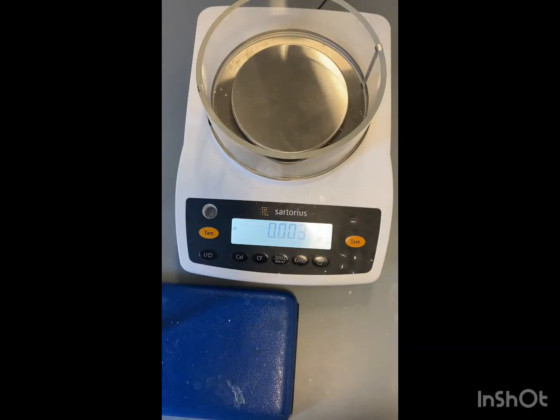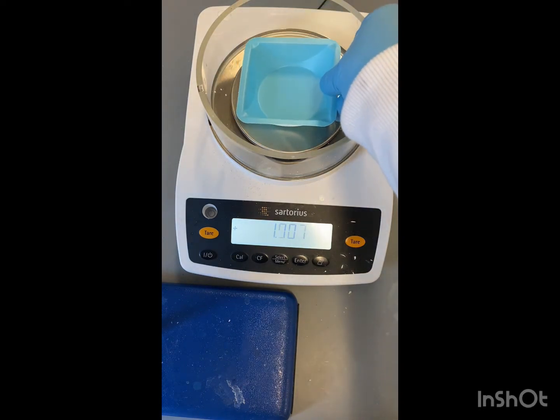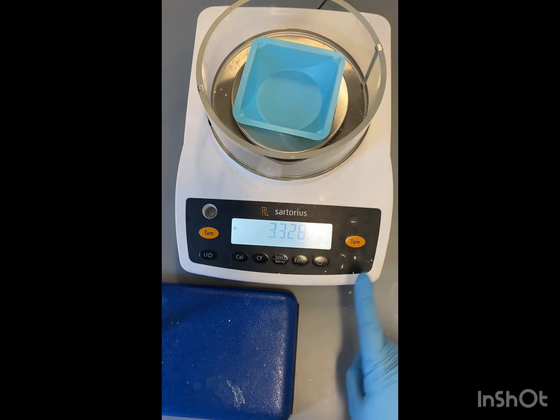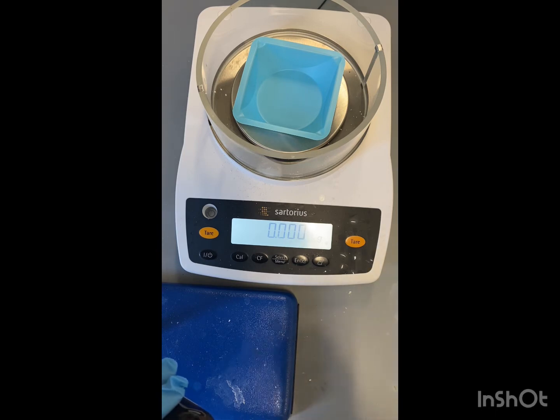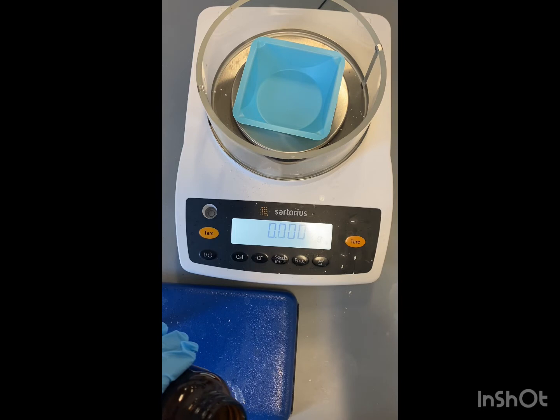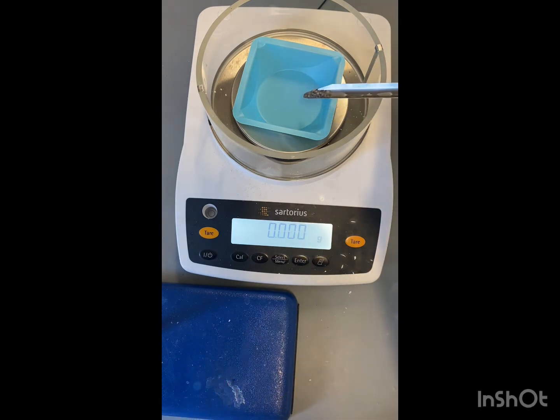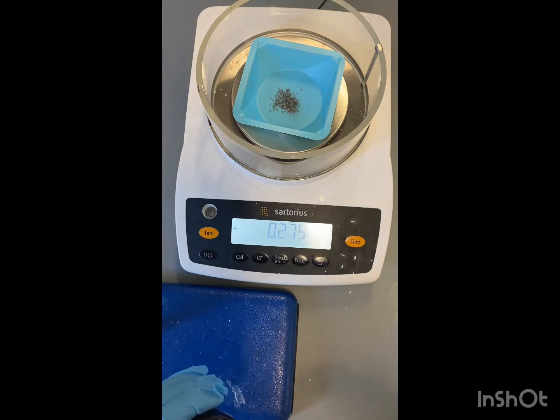Now that we have our safety goggles and gloves on, we're going to weigh out around 250 mg of the impure benzoic acid. First we're going to put our weigh boat on the scale, tare it, and then try to get around 250 mg of our impure benzoic acid. So we've got 0.275 grams. That'll be good.